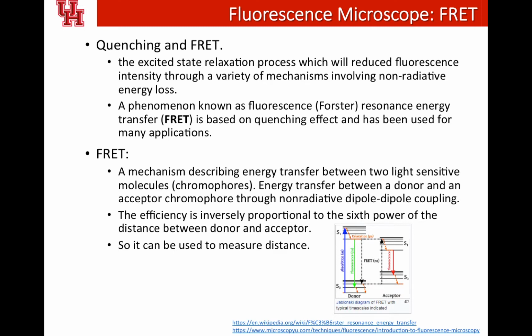But the quenching is different. Quenching is when you excite the molecule to the excited state. With photobleaching, you don't have to excite it. Before you emit light, the molecule has been bleached. And quenching means the molecule has been excited to the excited state.